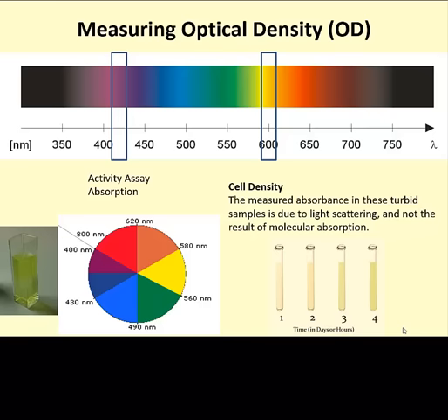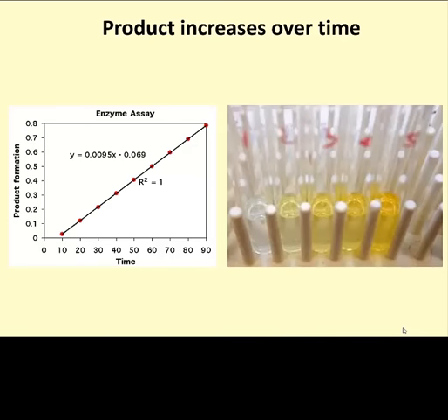For the enzyme assay itself, time is also important. Since the longer the enzymes are active in solution, the more product they will produce, until the educt is depleted. Therefore, to compare different samples, we have to stop the reaction at specific times and then normalize the activity by time.